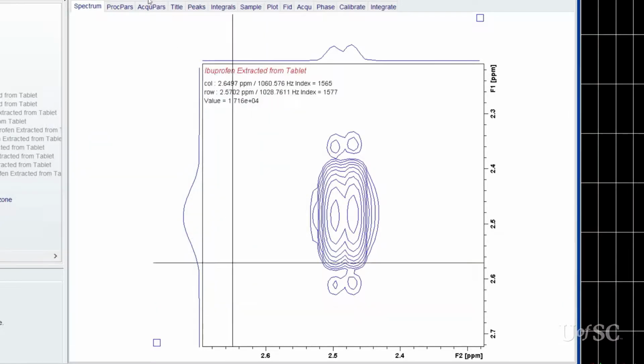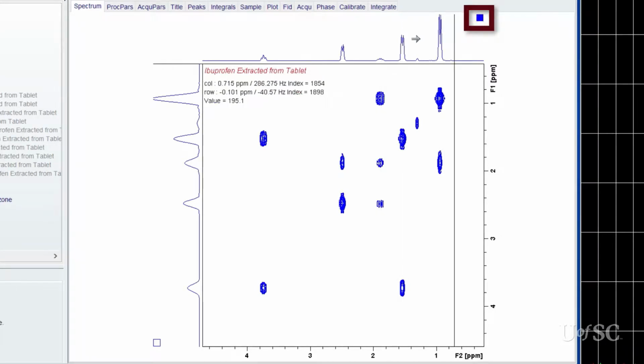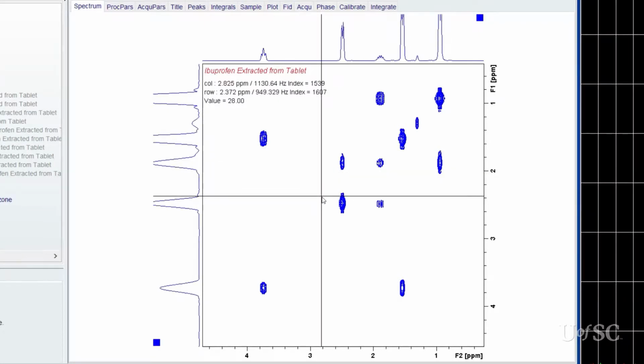The vertical heights of the projections can be adjusted by first clicking into the region to make it active. Notice that the small square above the projection becomes filled when selected. Now the mouse scroll wheel, or the vertical scaling buttons will work on the projection. You have to activate each projection separately. It is important to note that both projections can be active at the same time. Also note that you have to click on each to deselect them before you regain control on the 2D contour region.